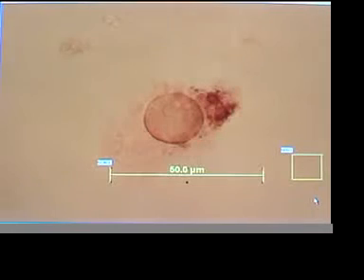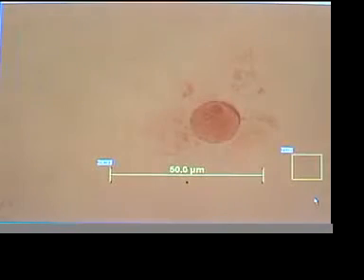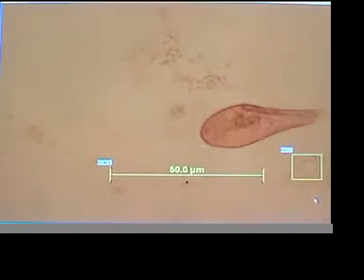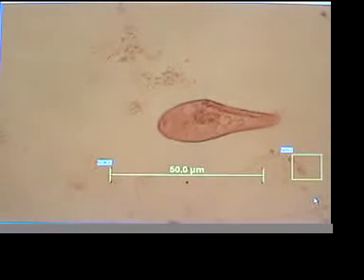And only select organisms are affected, although you can see here's another one who was similarly affected. But you also can find organisms who are not really dissolving, such as this organism here. He still has a little bit of motion, and he's not dissolving.